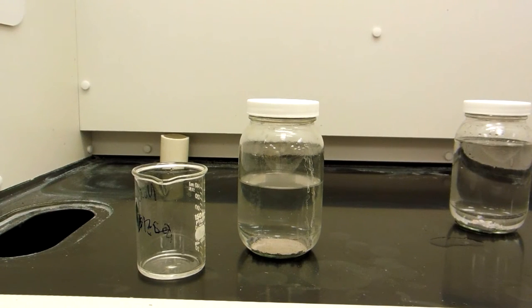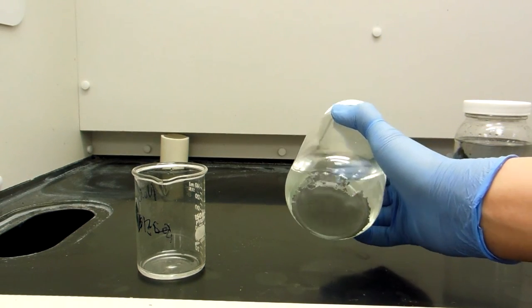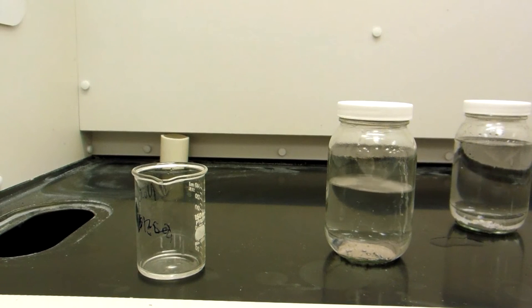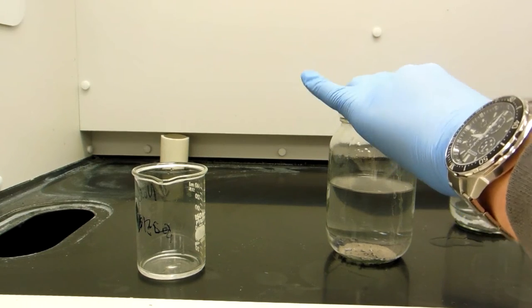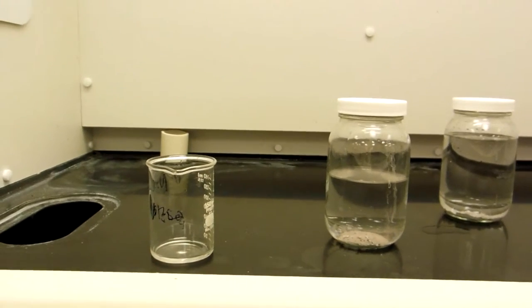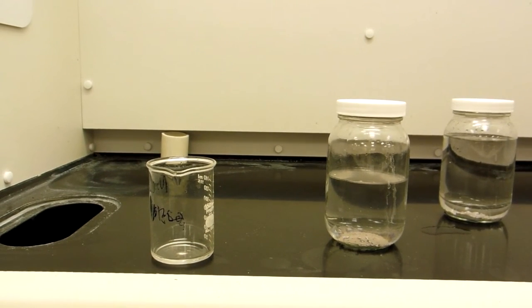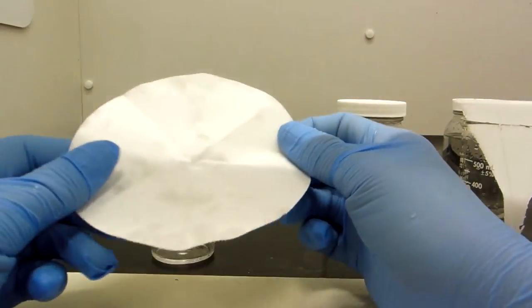Now that it is known that there's no more silver in the solution, the next step will follow. So I will filter off all of the solution via gravity filtration with no use of the vacuum pump. I'll use quantitative filter paper. So I'm repositioning the camera once again. And I will show you how to fold it.